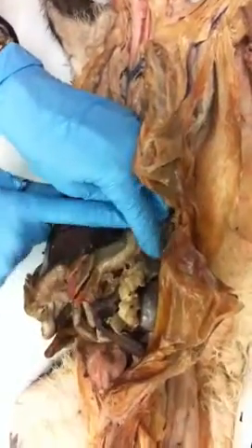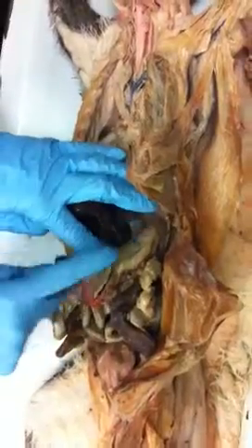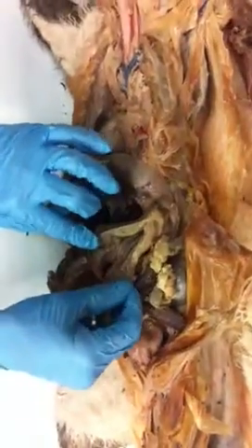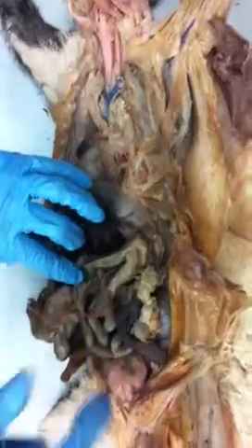This is the fundus, again, the top. This is the body. And then this part down here, kind of the bottom of the J, right here, is the pyloric region of the stomach. Okay? If we open up that stomach, those are the rugae. All the folds, the extra folds in here allows it to expand when food comes in.